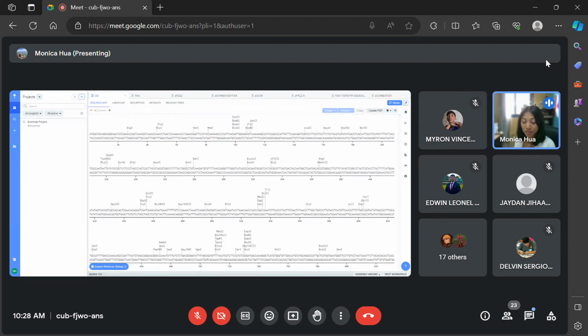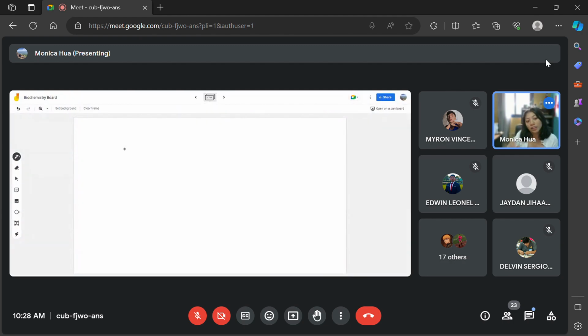So you have to choose a vector that you're going to insert the sequence into. Now, in order to insert this into a sequence, so let me go to my little chart. Each of these vector maps is circular, so we need to open up this circular map, which basically means to cut it and insert this sequence in.